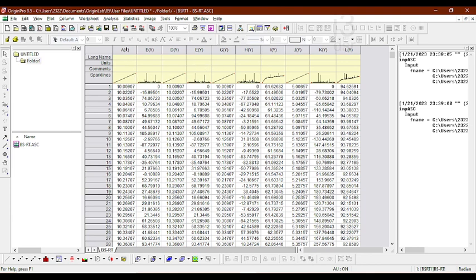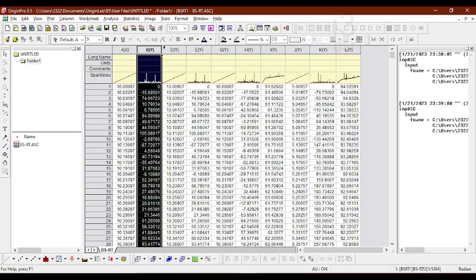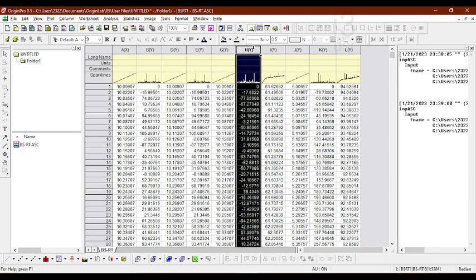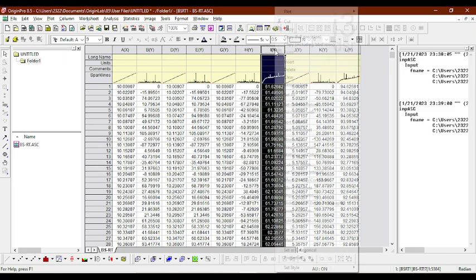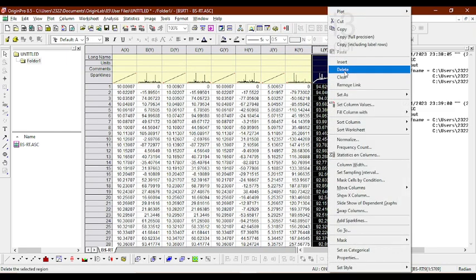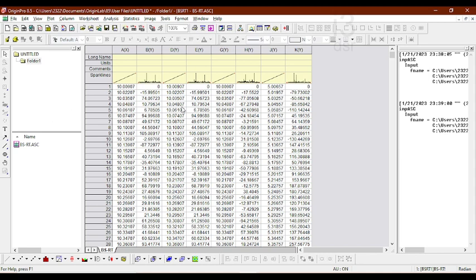The first two columns are 2 theta values and intensity, then 2 theta values and intensity, and 2 theta values and intensity. So I'm going to delete this, and also this. I think one of the data is repeated, because you could see that 15 and 91 repeat. These are three datas: this is one data, this is the second data, and this is the third data, and this one is repeated because we did it in the previous file.